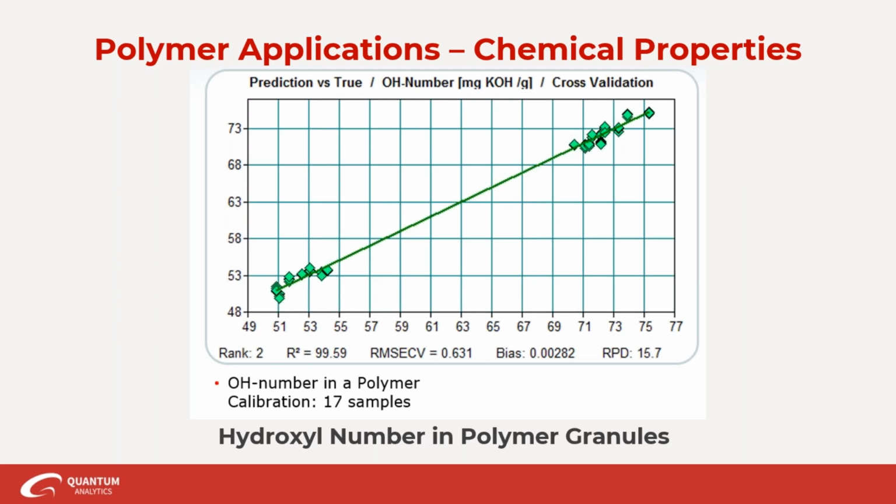Now, if you're talking about a natural product, say something agricultural that's grown outside in the field, and you're using different kinds of soil, different kinds of fertilizer. If the field's really big, maybe some areas are getting more sunlight than others, more rainfall, whatever it may be. Those kinds of things can introduce changes into your near-infrared spectra that are not related to the parameters you're actually trying to measure.